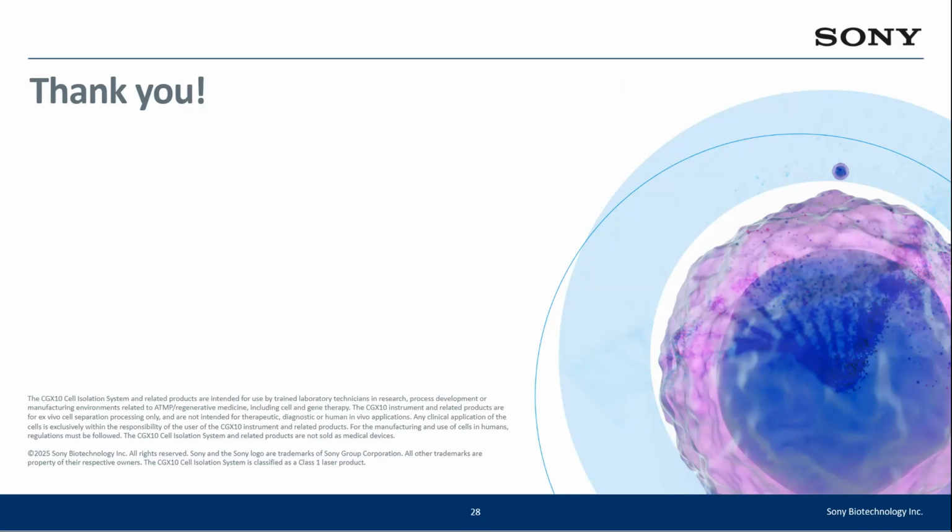Thank you, Aditi. Our next question here asks, what are the buffers provided with CGX10? All right, I'll take this one. So for standard issue, the CGX10 includes a 5-liter bag of sheath fluid, as well as a 1-liter bag of collection buffer, which is more than sufficient for even a 10-hour run.